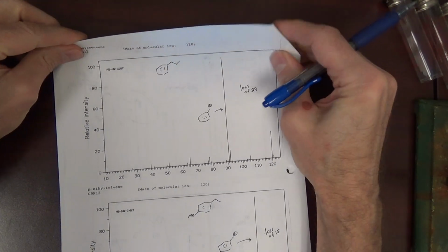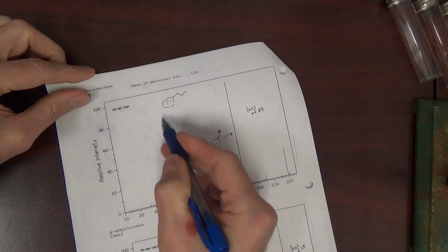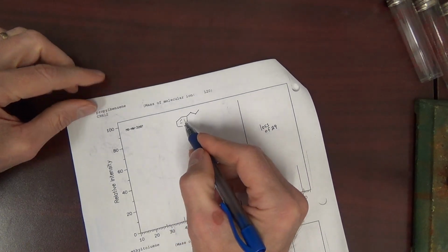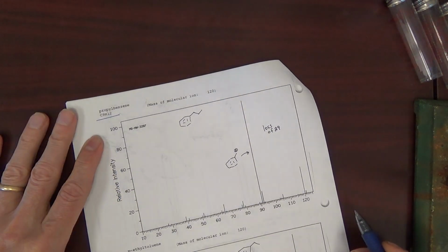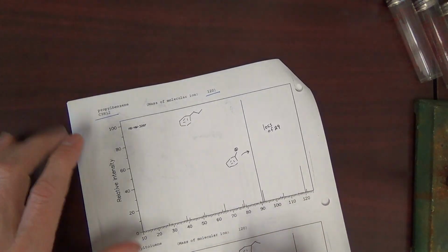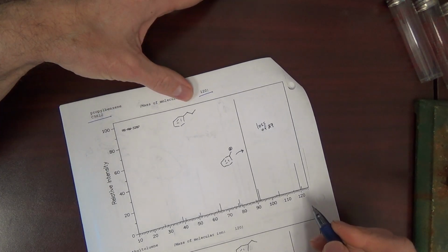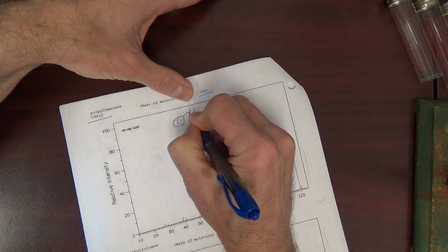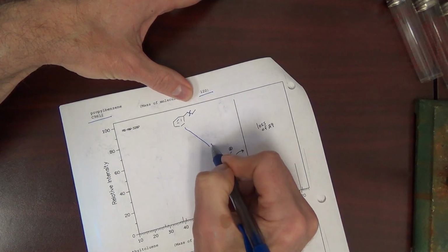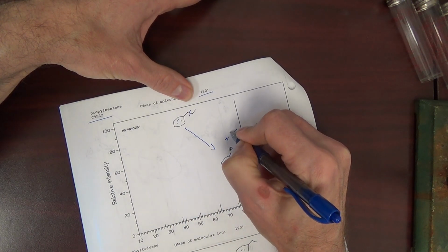Okay, over here we're going to bring in pi bonds because we know we can do resonance with pi bonds as well. Benzene compound, molecular weight of this is 120. Add it up. 120. Best place for this to cleave? It's right here. That will give this cation plus an ethyl radical.